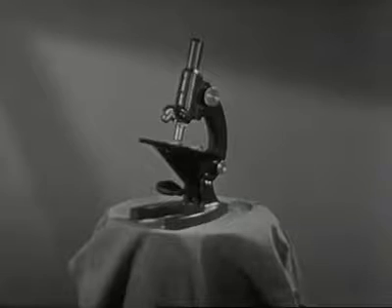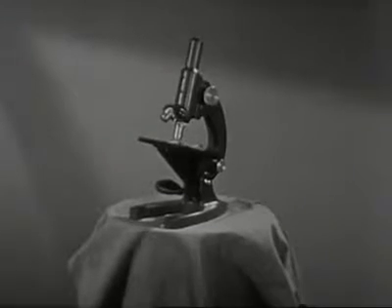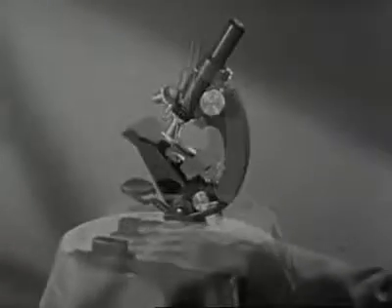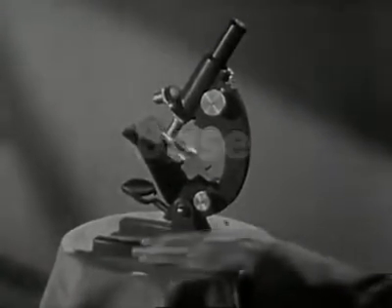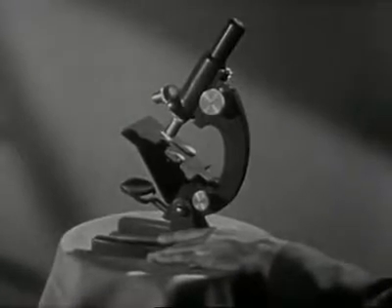As the first step in learning to use the microscope, we must become familiar with the names of the main parts of the standard instrument. The base is so named because it supports the microscope. It is fairly heavy to make the instrument stable.